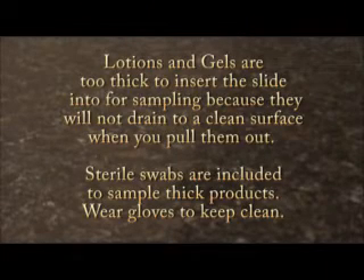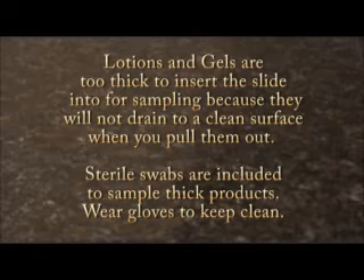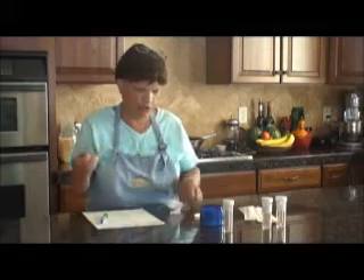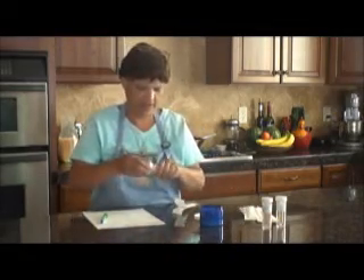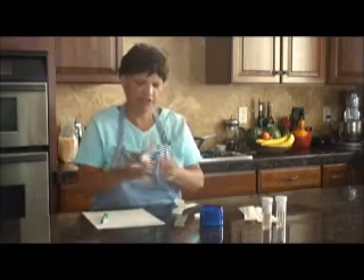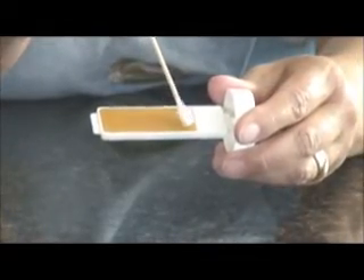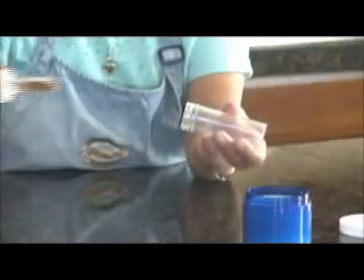Lotions and gels also need to be tested, but you cannot dip the slides into thick products like lotions and gels. Sterile swabs can be used to sample these products. First, remove one of the test incubators from the box as well as one set of sterile swabs. Open the cap or lid of your lotion and dip your sterile swabs into the lotion. Smear the lotion on the swab onto the paddles, being sure to cover them completely. A thin coating is sufficient. Place the slide back into its cover and close tightly. Discard the swab.